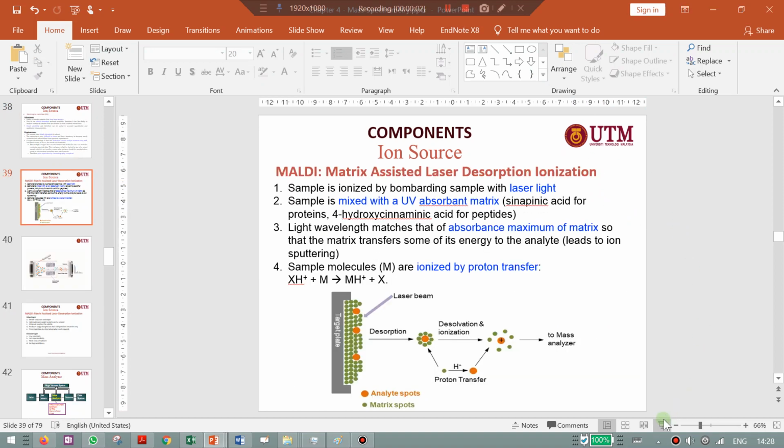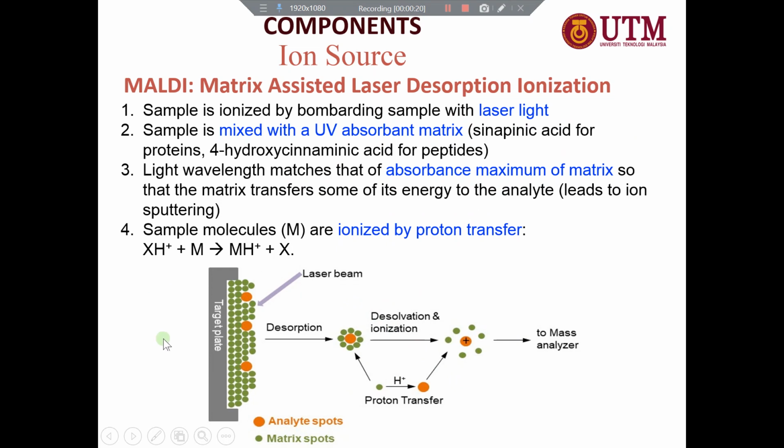Alright, the next one we have is MALDI. MALDI stands for matrix-assisted laser desorption ionization. It involves a laser process of desorption from the plate as well as ionization. How does it happen? We can refer to this figure.